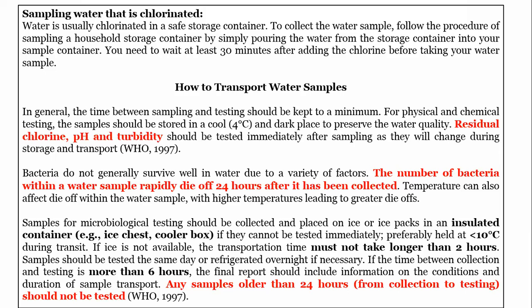And you must also understand that immediately after you take your sample, there are some tests which are most important to do: the pH, the turbidity, and the residual chlorine in the water. You must do these tests immediately in the field before taking the sample to the lab for further testing.